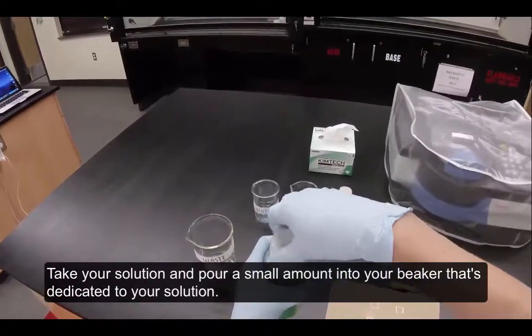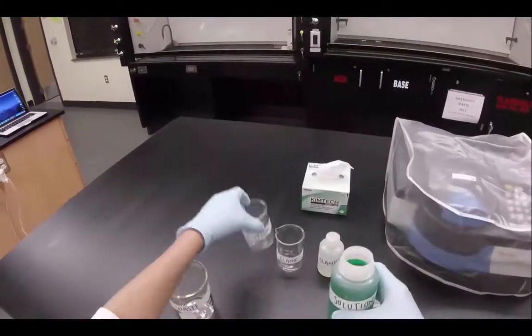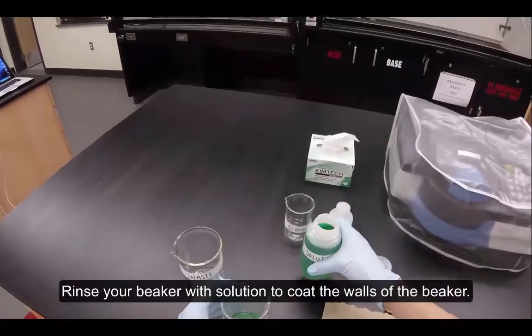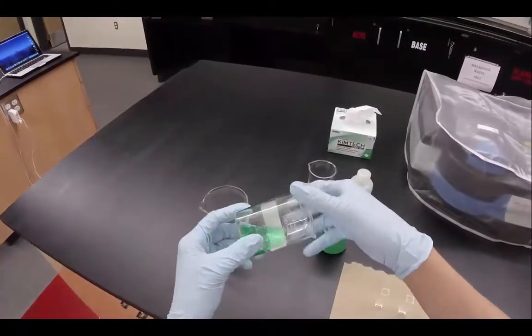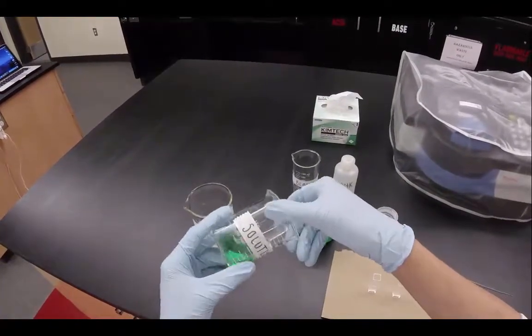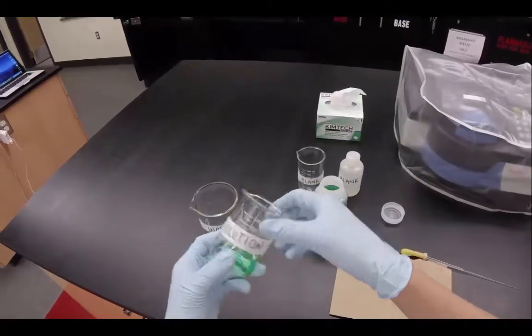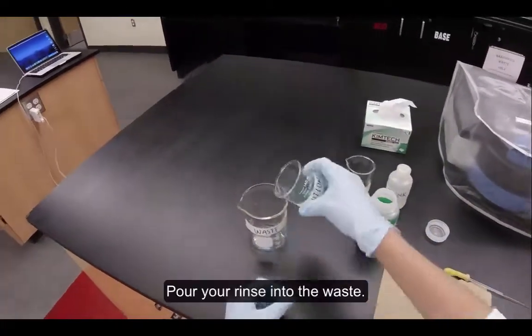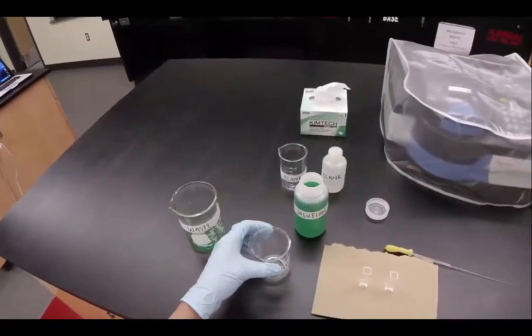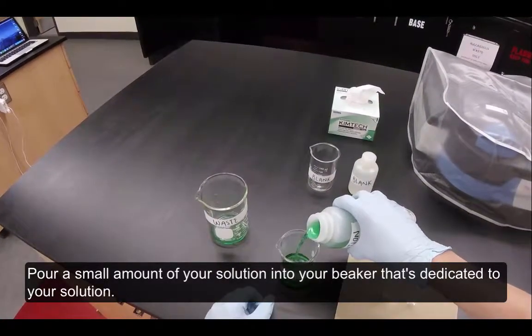Take your solution and pour a small amount into the beaker dedicated to the solution. Rinse your beaker with solution to coat the walls of the beaker. Pour your rinse into the waste, then pour a small amount of your solution into the beaker dedicated to your solution.